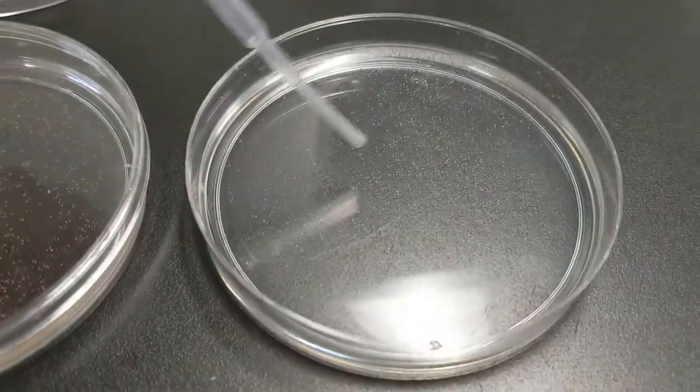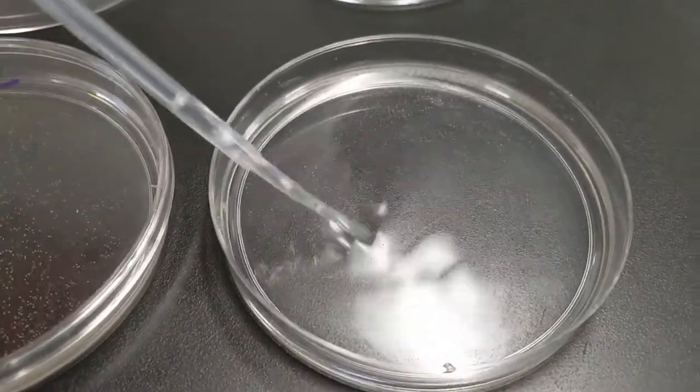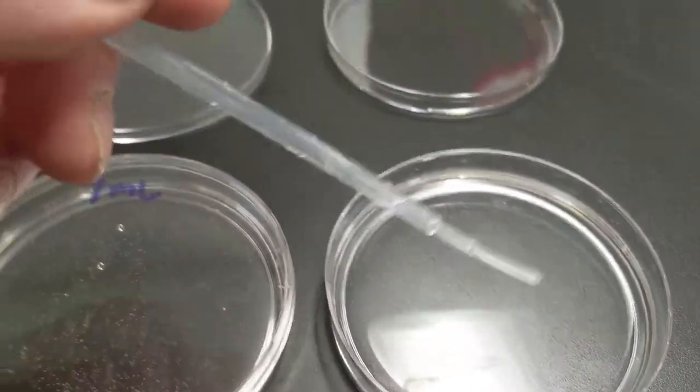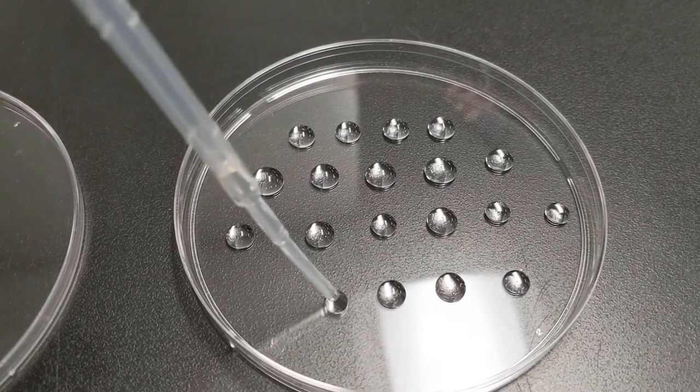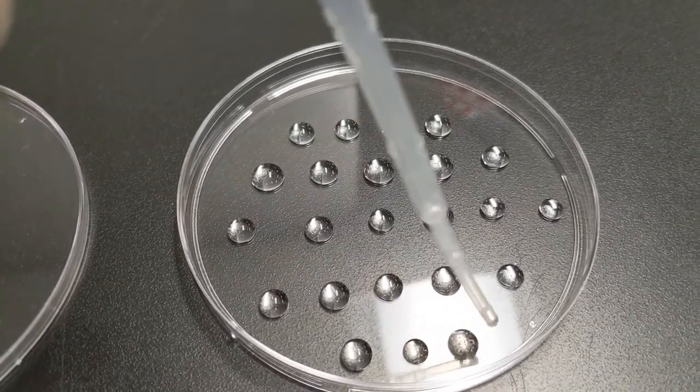We're measuring hatch rate and how salt levels affect hatch rate, so it's going to be important that we get all of our samples on the same day. We'll open up each petri dish, stir it, and with a fresh pipette we will plate about 20 to 35 drops of water from each sample and count the number of brine shrimp per sample.